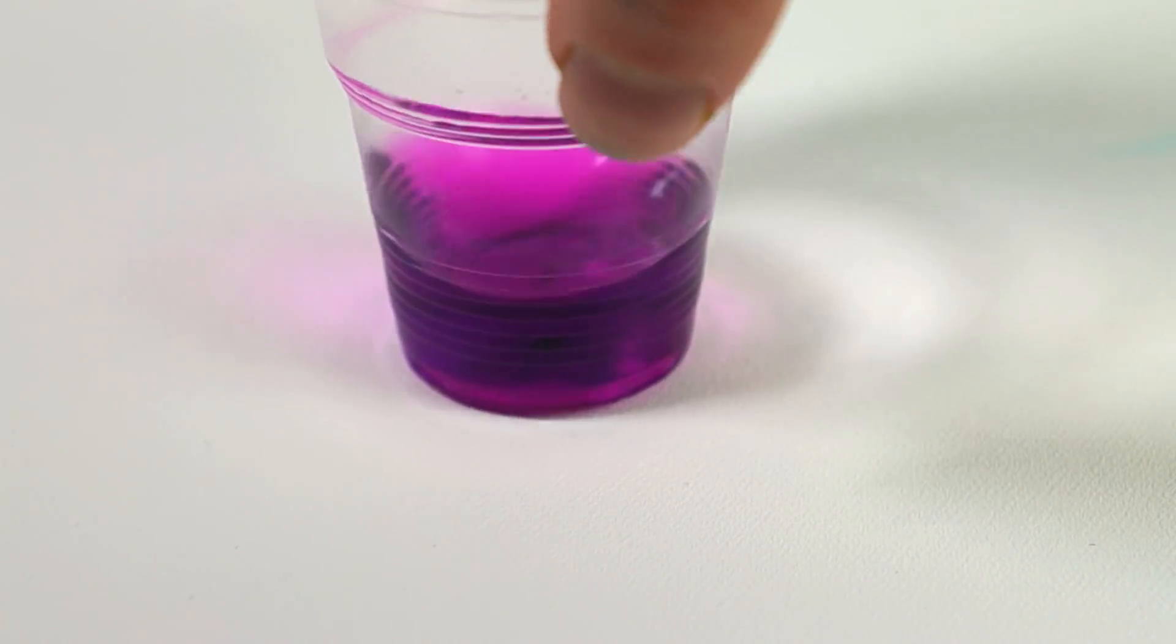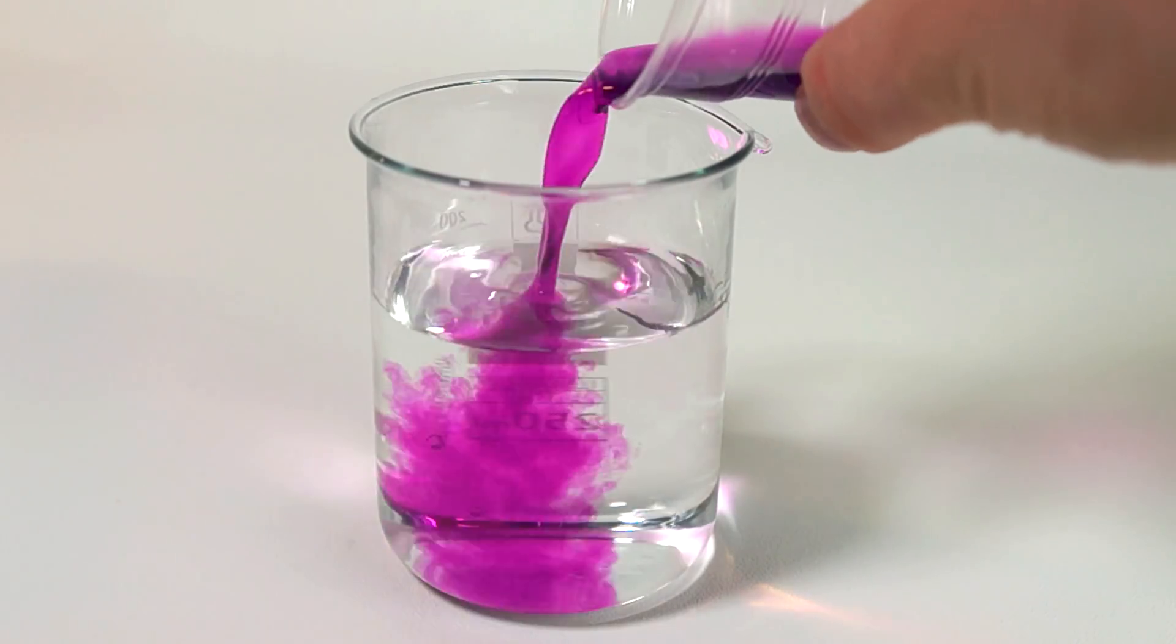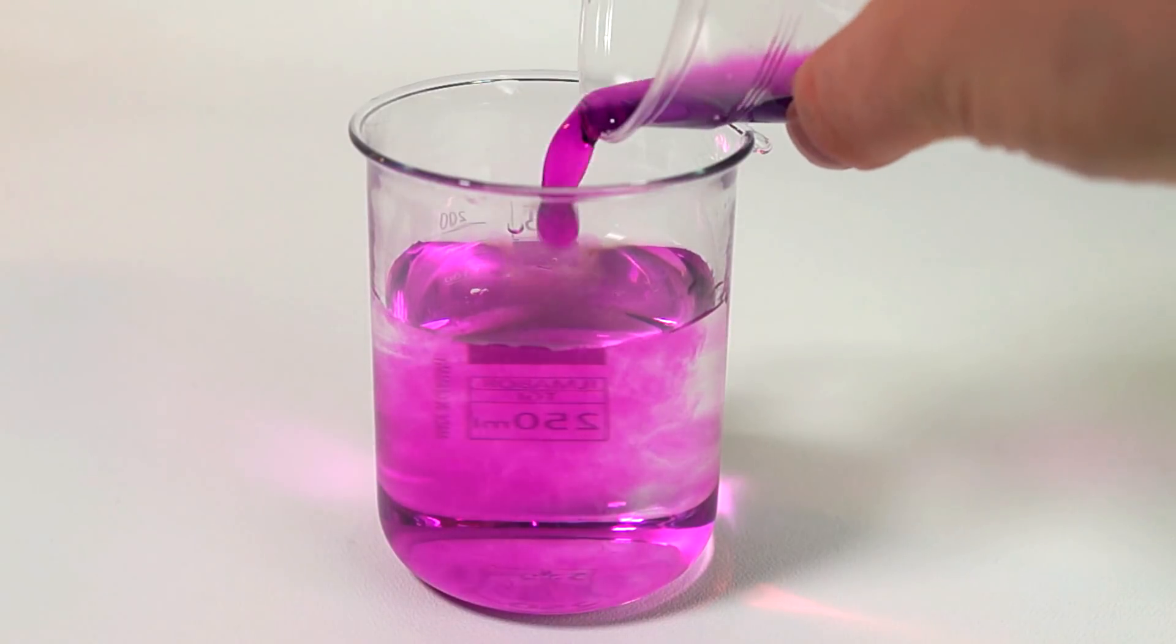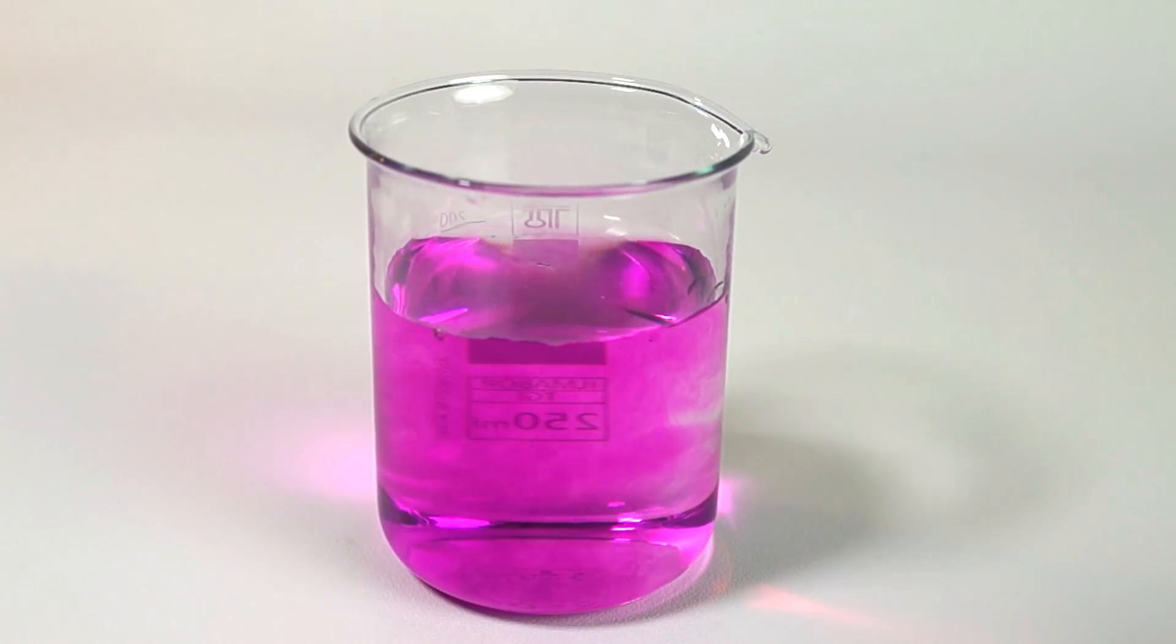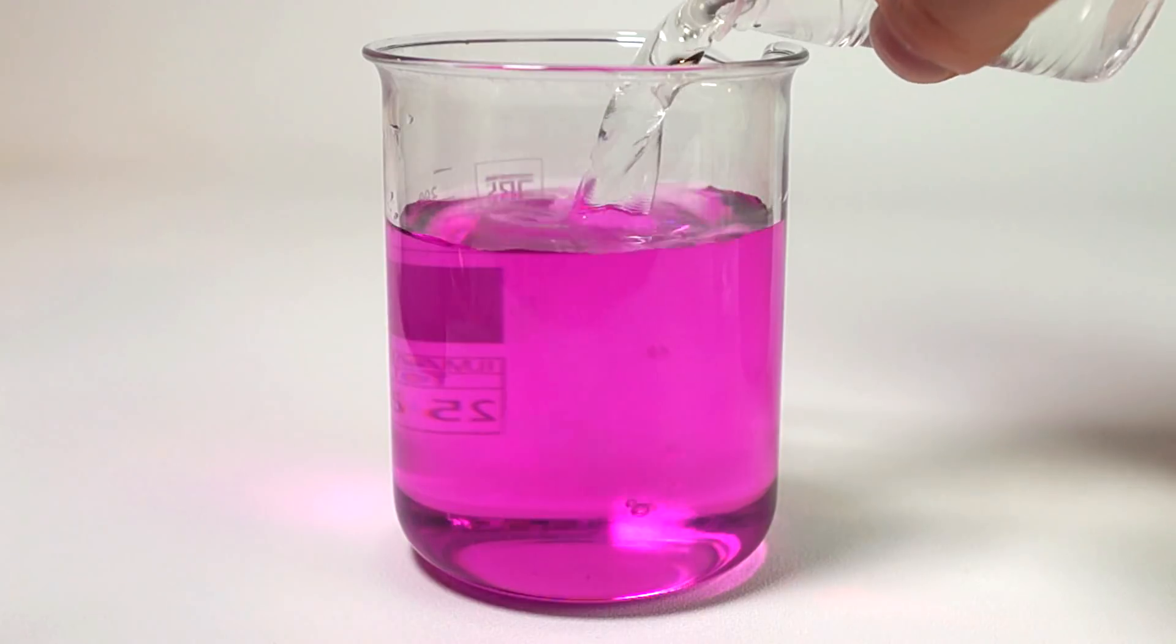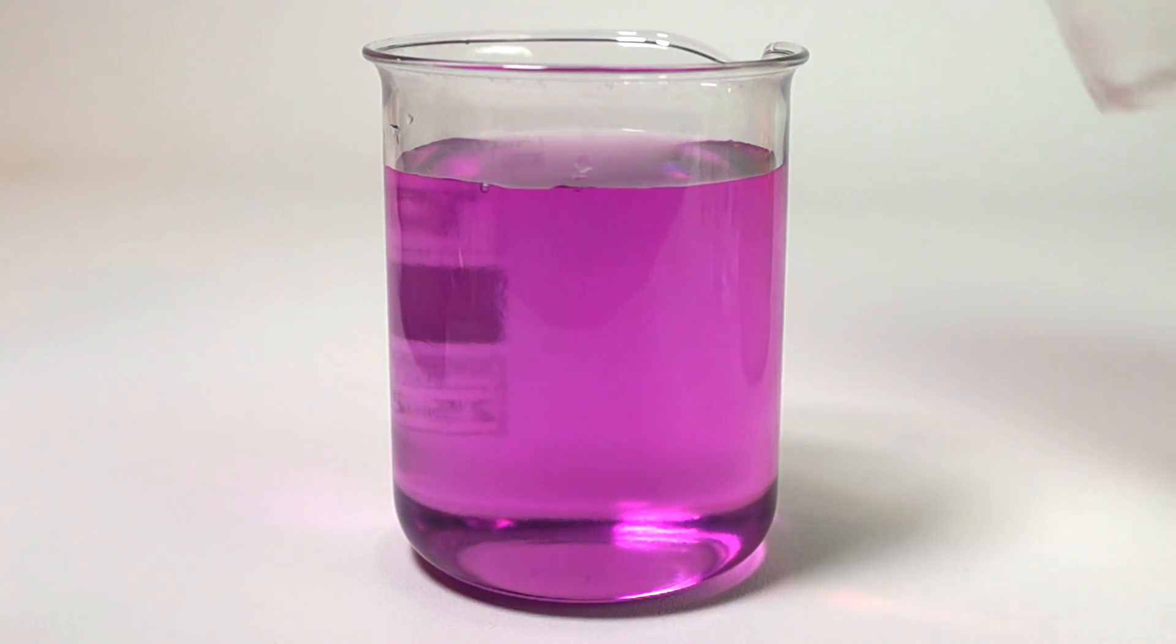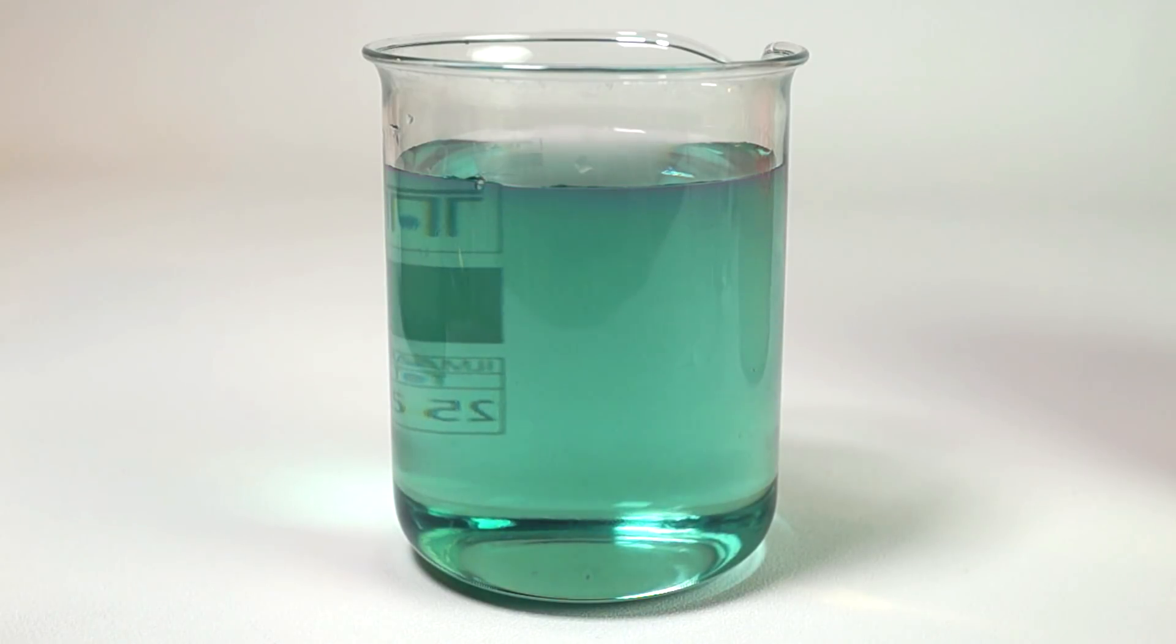With this compound you can conduct an interesting experiment called the chemical traffic light. To do this, we'll make a weak solution of potassium permanganate, and then we'll add an alkaline sugar solution to it. In the alkaline environment, potassium permanganate oxidizes the sugar, thus reducing itself first to the green potassium manganate and then to the yellow manganese dioxide.